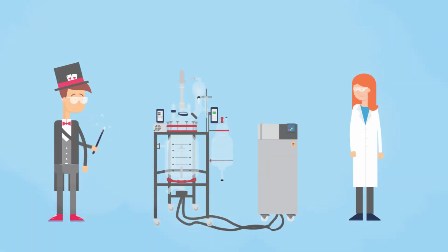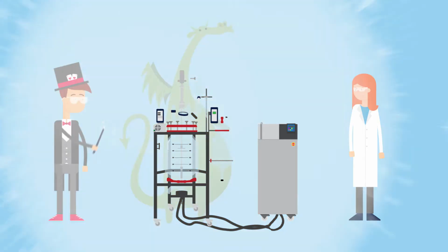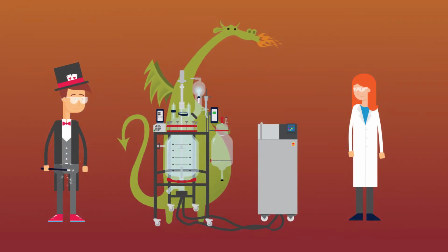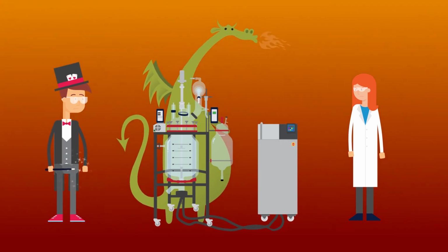Air-cooled condensers exhaust heat into the surrounding environment, while water-cooled condensers can transfer heat into the lab's water supply. Remember to consider the ambient temperature where the chiller will be operating. If the room is above 20 degrees Celsius, or the temperature is variable, you may wish to add your calculated heat load and choose a larger circulator.